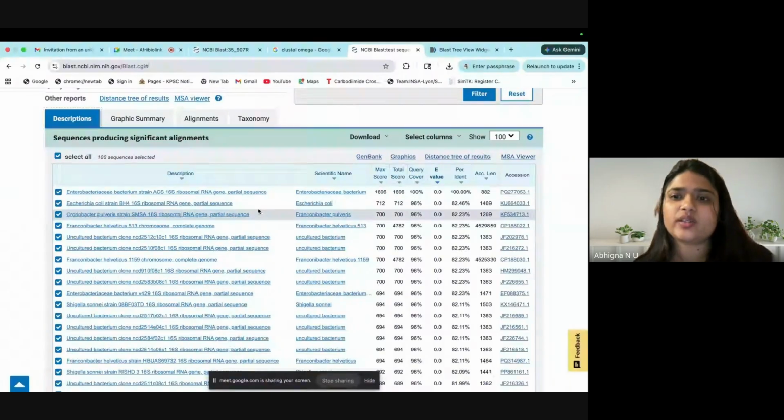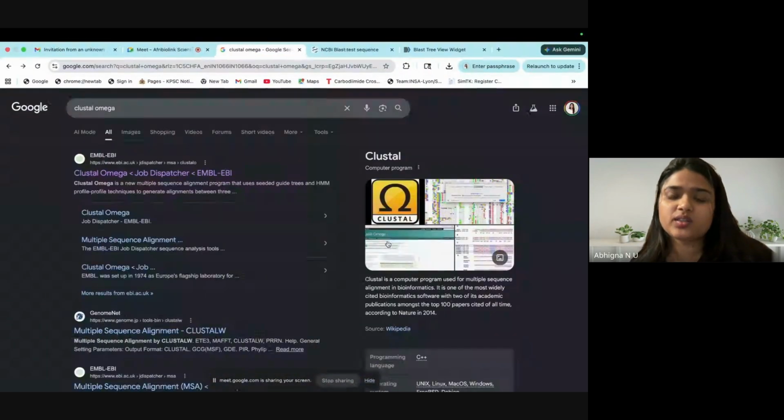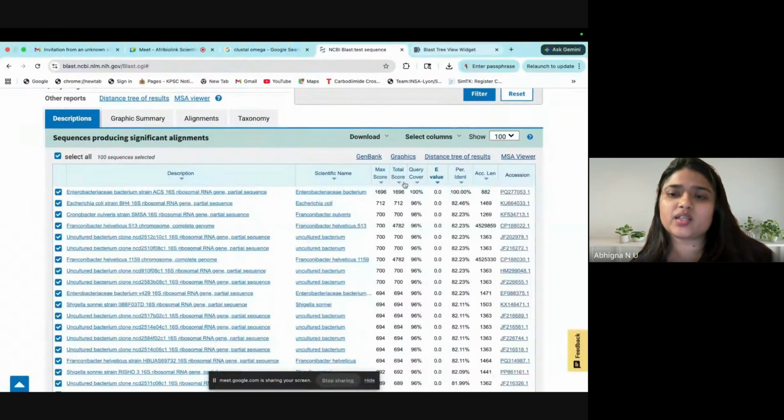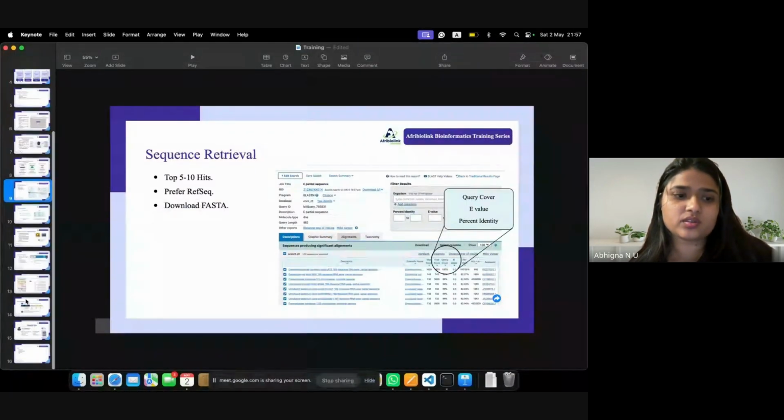Okay, now we'll go for hands-on. In the hands-on, you will be performing the NCBI blast. I'll just give you the sequence.